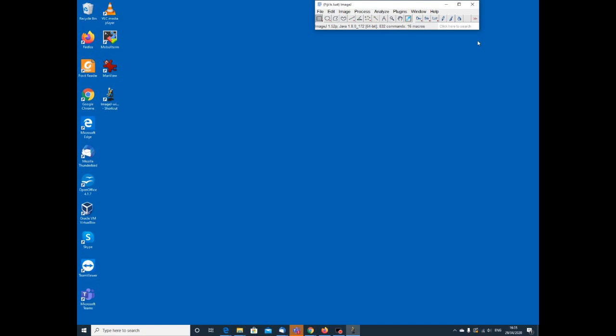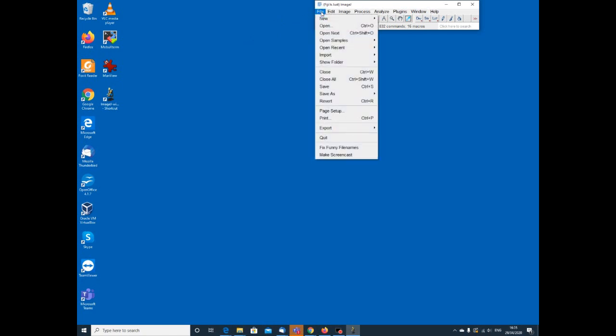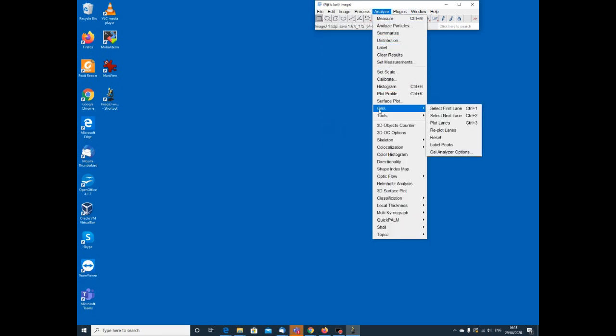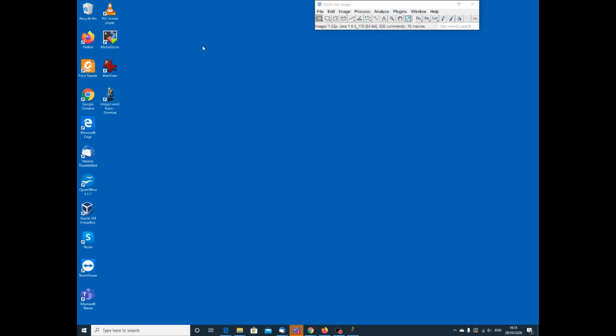There's a few elements that might be worth looking at. We can see we've got the menu system along the top. If I left click on that menu, then I can move around the menus and open up the submenus with my mouse. Click on the screen to get rid of that. We've also got some fast menus with pictures, little icons on them to make it easier to navigate.